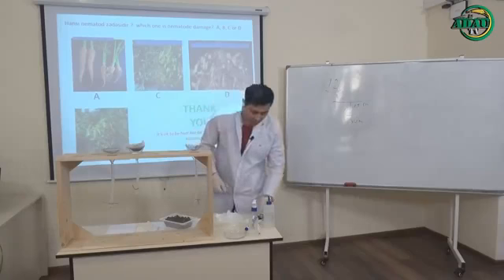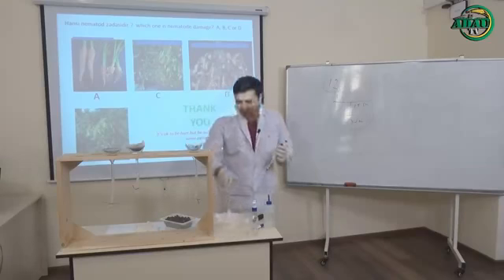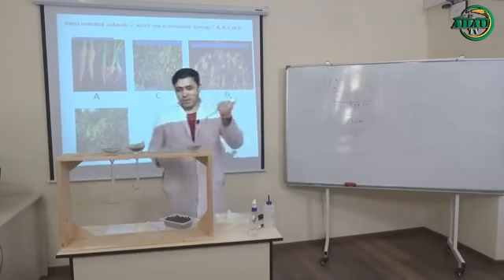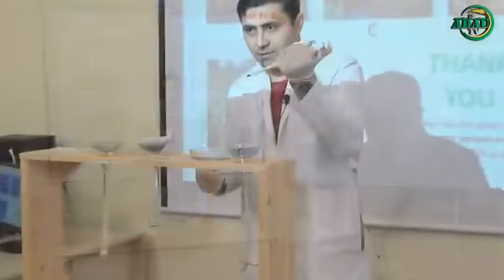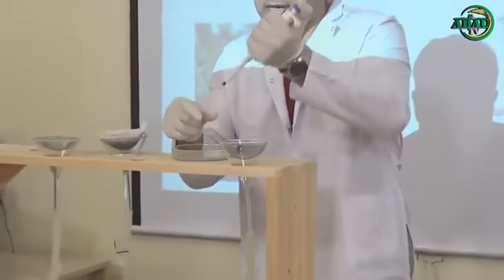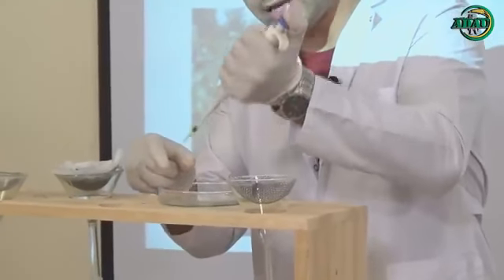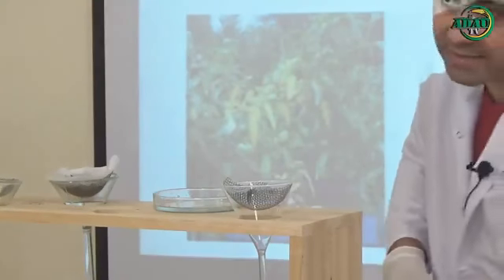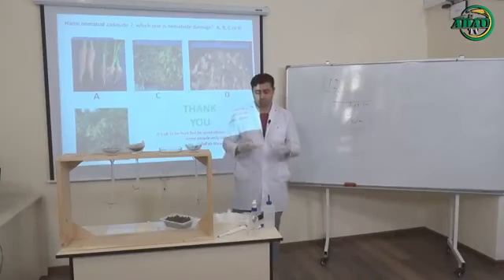That's why you have to take the Petri dish. It's so easy. Just put the glasses or dishes under the microscope and look with the microscope and take these nematodes with a pipette and add them to a glass. After that, take this glass and put it under the microscope. Then you will see all these nematodes.